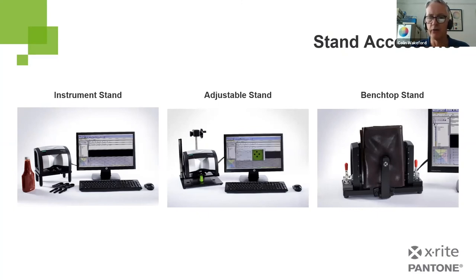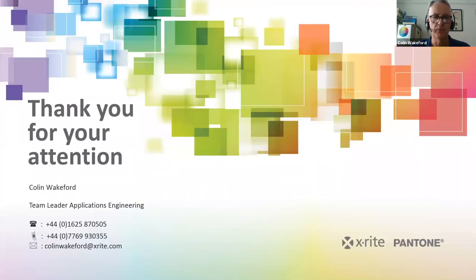And then finally, on the right, the benchtop stand, which basically turns the instrument into a benchtop instrument where you can place samples against it. For some people, that gives the benefit of a benchtop instrument and a non-contact measurement when it's horizontal. So thank you very much for your attention. And I guess I hand back to Anne-Marie now, if anyone has any questions.